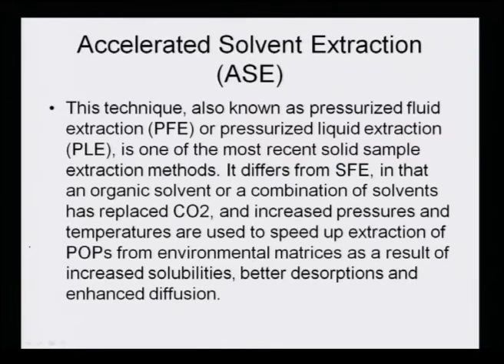It differs from SFE in that an organic solvent or a combination of solvents has replaced liquefied carbon dioxide, and increased pressure and temperatures are used to speed up the extraction of the POPs from environmental matrices as a result of increased solubilities, better desorptions and enhanced diffusion.